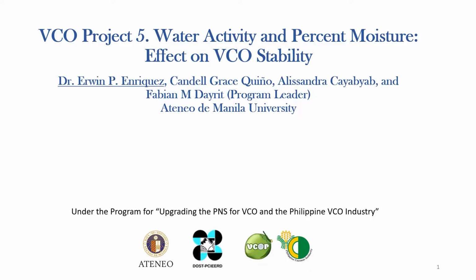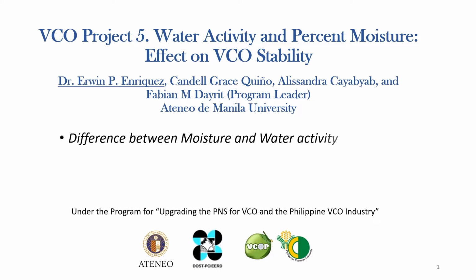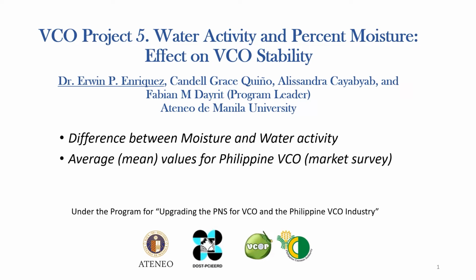Hi, this is just a short presentation on measurement of water activity and percent moisture on VCO products from the Philippines. I'm Erwin Enriquez from Ateneo de Manila University. In this short presentation, we would like to note the difference between moisture and water activity, what the mean values of water activity for VCO are, and also how we can measure it using the kit that we developed.